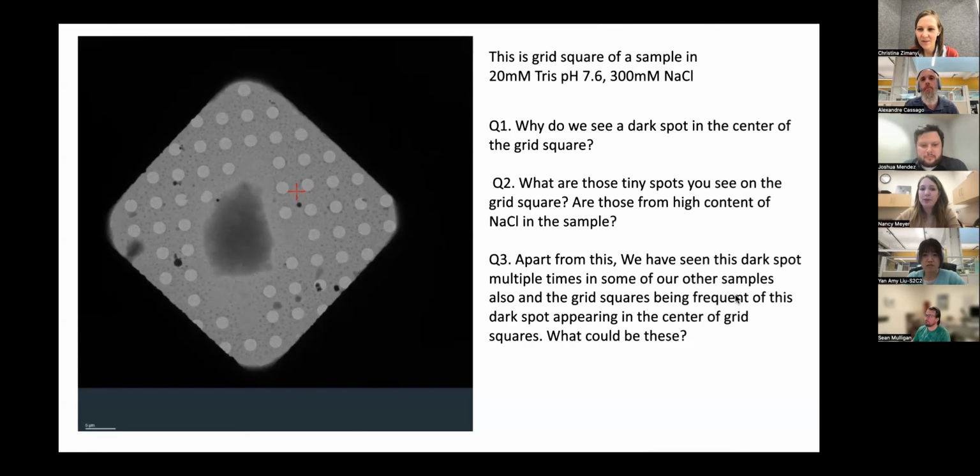Yeah, it's very time consuming when you have that combination of completely dry holes and then holes right next door that have ice in them. So ideally, if you can get better spread on the grids, it'll make your life easier. But like you said, you can collect if you've got enough, but it's very, very crafty. Your hand will hurt.